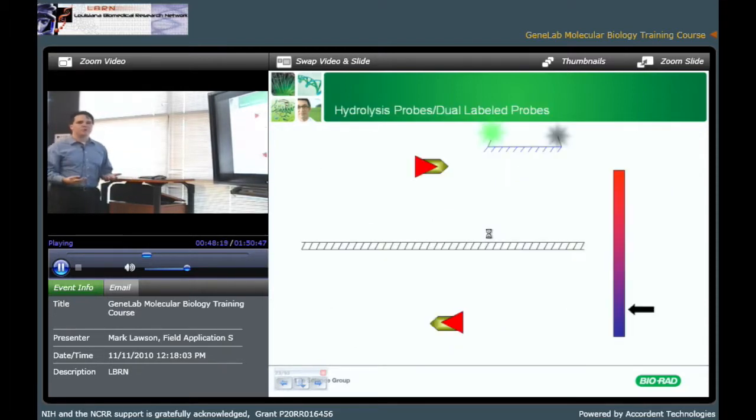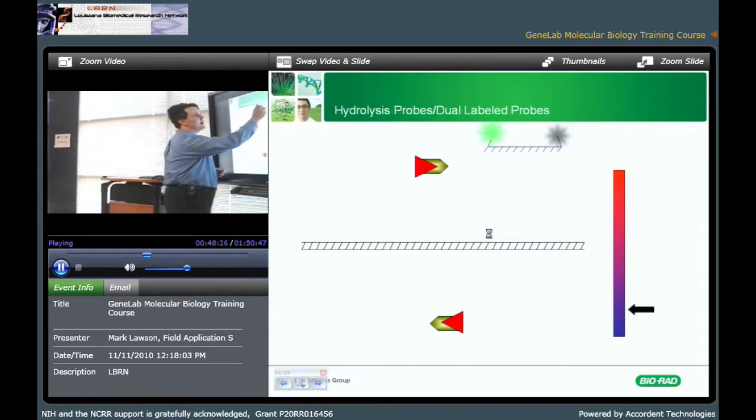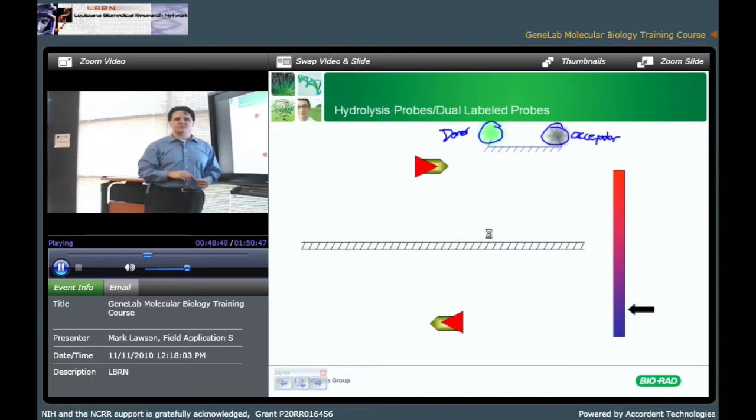So we have a probe in our PCR reaction, if we're going to use a TaqMan or other probe chemistry, and it has 2 dyes that are within a FRET distance of each other, close enough together that this donor dye, which is bright, and the acceptor or quencher dye interact with each other. I'm exciting this dye, but I'm getting a signal off the acceptor dye, and I'm not looking for that signal. So we're calling that quenched, when in fact we're just shifting the wavelength out quite a bit to the red.